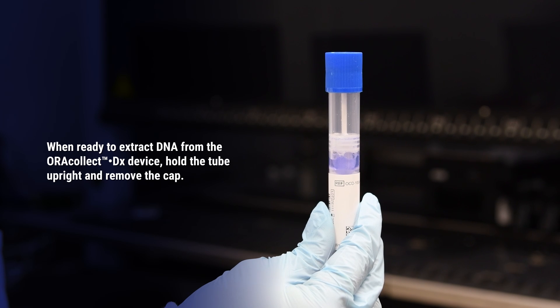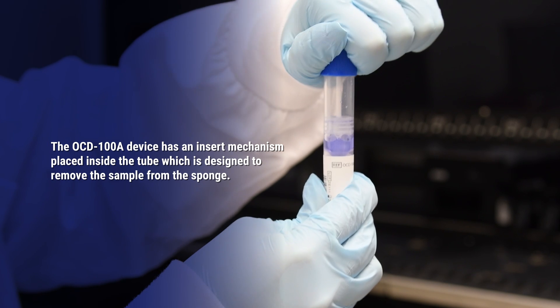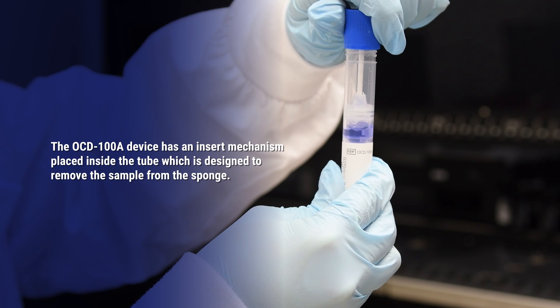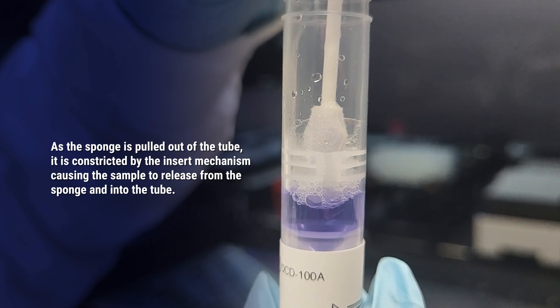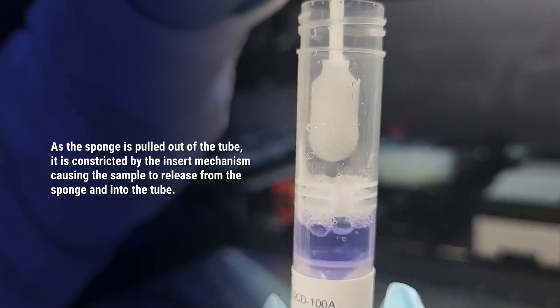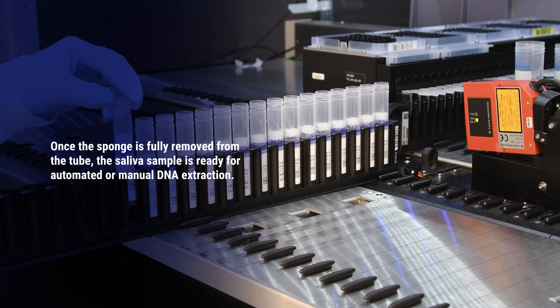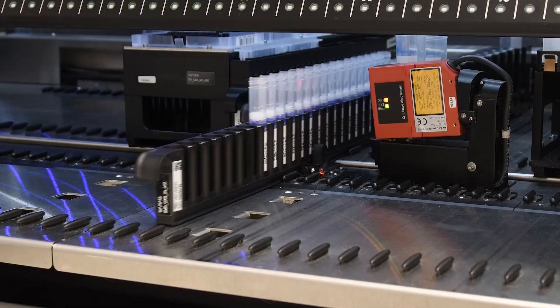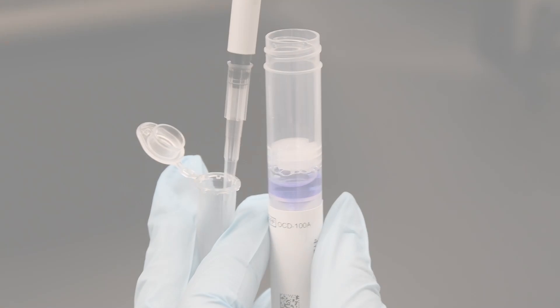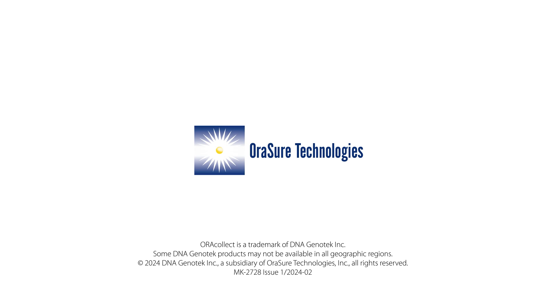When ready to extract DNA from the AuraCollect DX Device, hold the tube upright and remove the cap. The AuraCollect DX Device has an insert mechanism placed inside the tube which is designed to remove the sample from the sponge. As the sponge is pulled out of the tube, it is constricted by the insert mechanism, causing the sample to release from the sponge and into the tube. Once the sponge is fully removed from the tube, the saliva sample is ready for automated or manual DNA extraction.